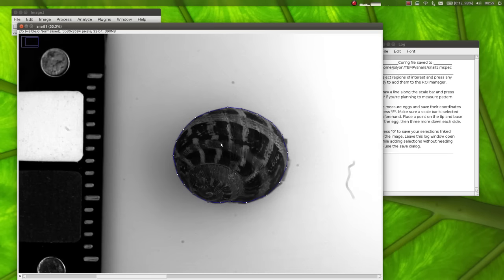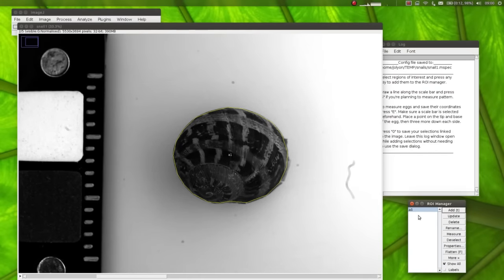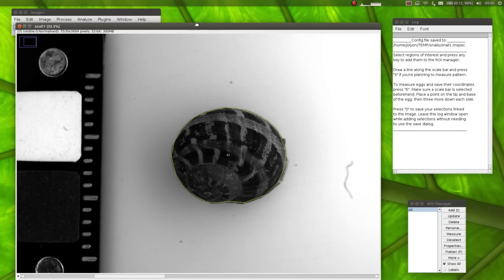Once I've selected the region, I'll press a key on my keyboard that I want to associate with the snail. Normally you might think of pressing S, but S is a special key for selecting the scale bar. So for now I'll just press A, and it will describe this region as A1. If you look, this has opened up the ROI manager, region of interest manager, and added A1 to the list of ROIs. You can delete this ROI if you want, and you can modify it in any way. So if I deselect it and then reselect it, I can just adjust it like this.